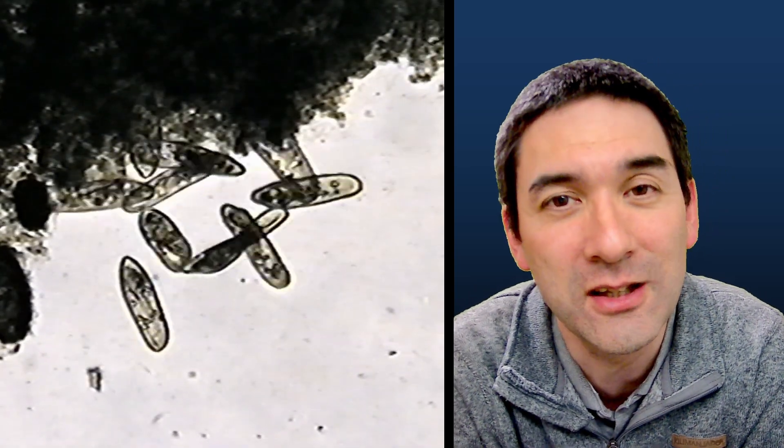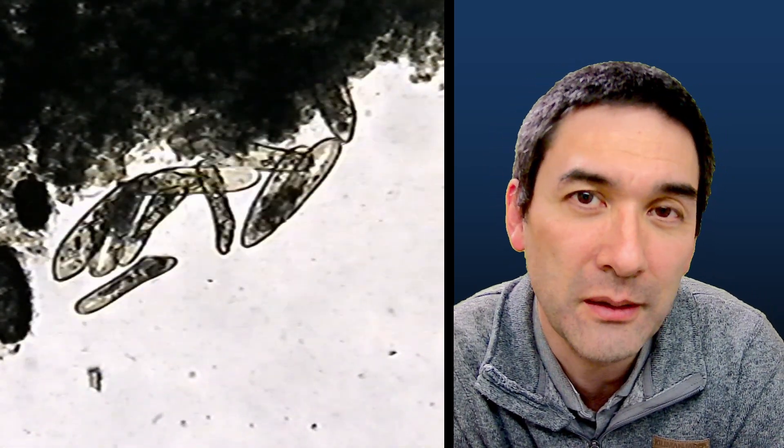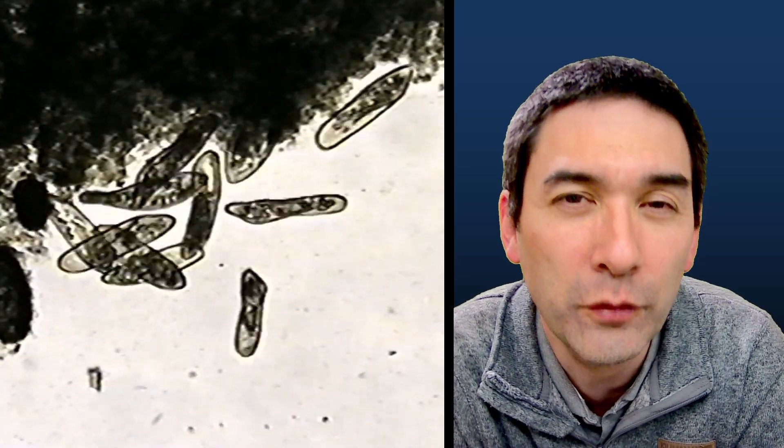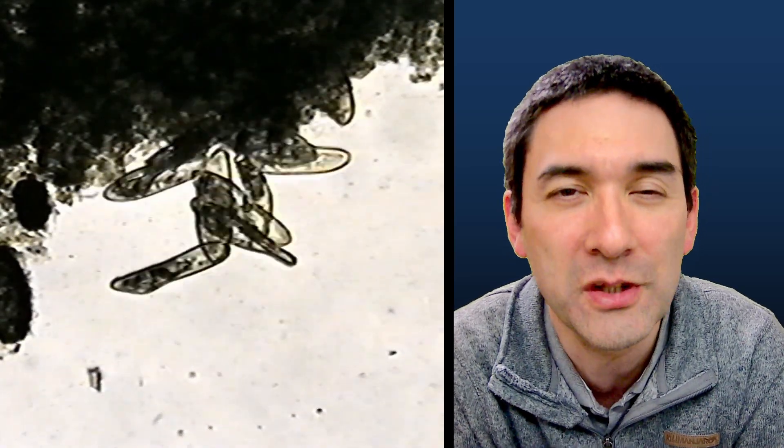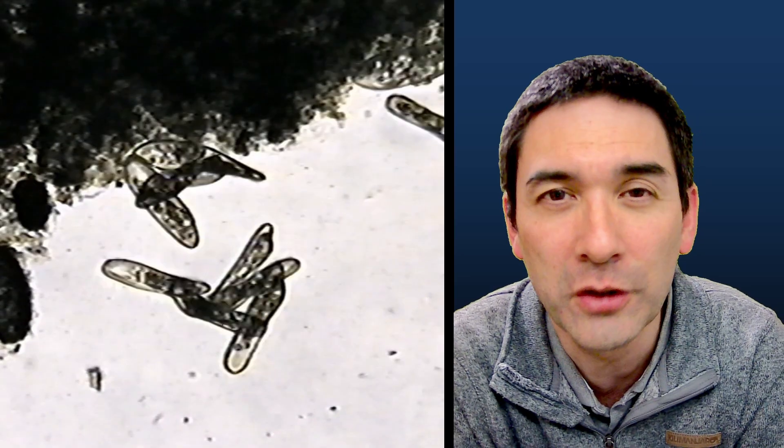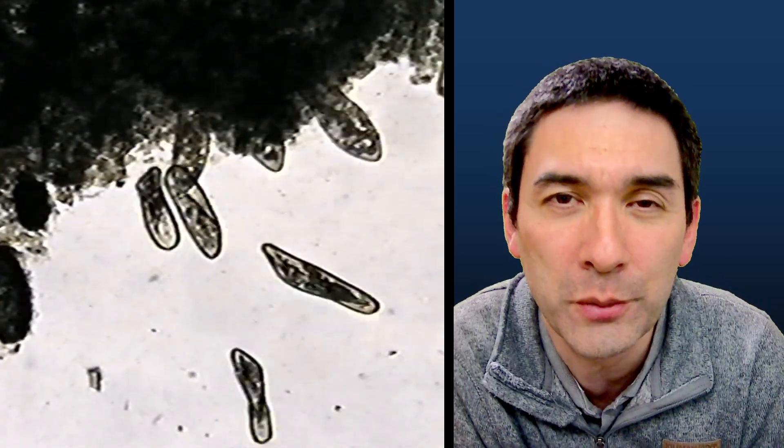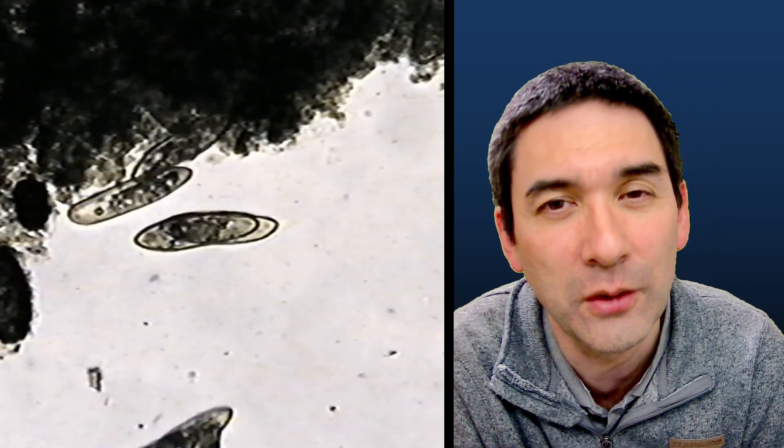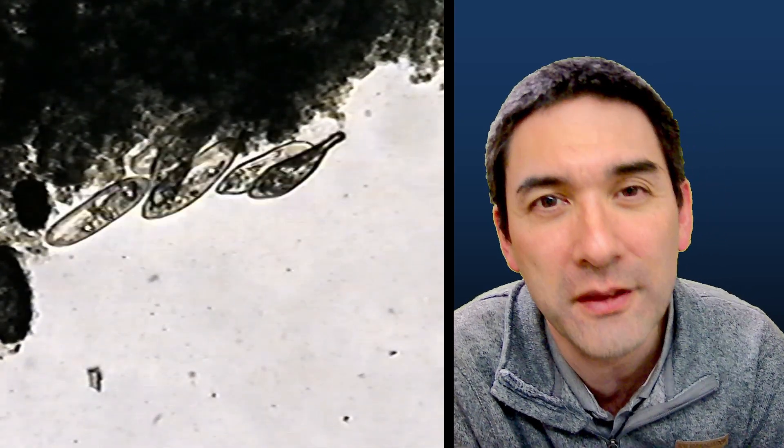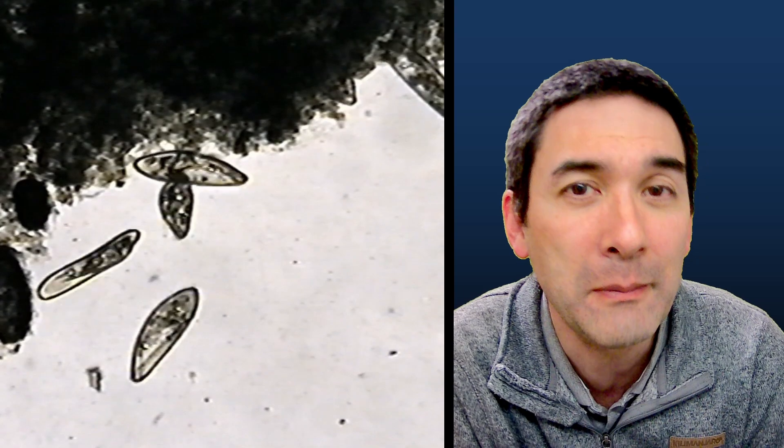But the really interesting thing is when I added the salt water. Those paramecia here cannot move away from the salt because at the top there are some algae and some other solid material which acts almost like a wall. The salt water is approaching from the bottom, and if you look very carefully you're able to see that those paramecia start to become thinner and thinner and thinner as they lose water.